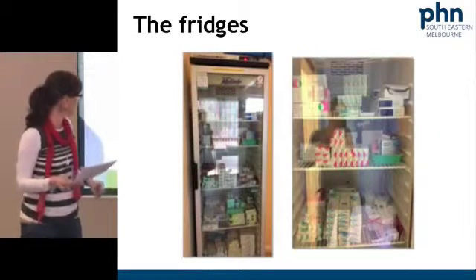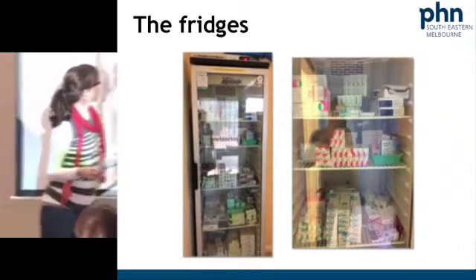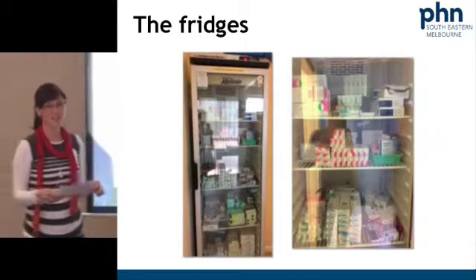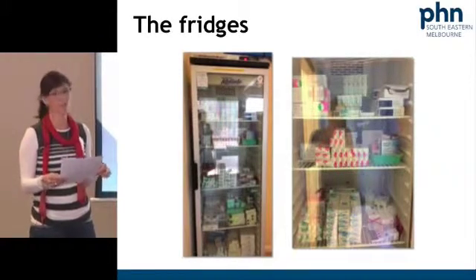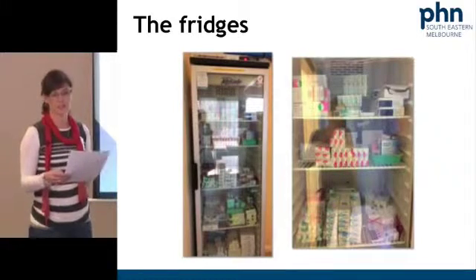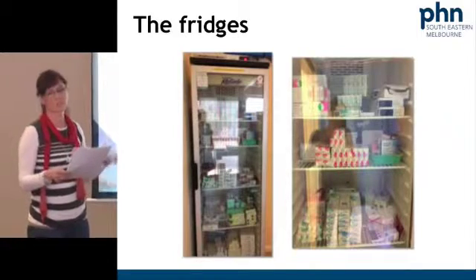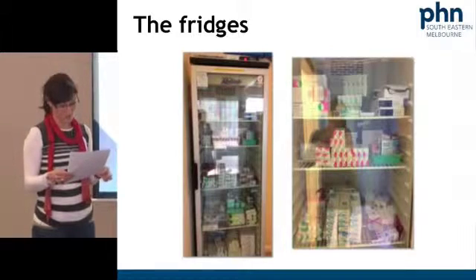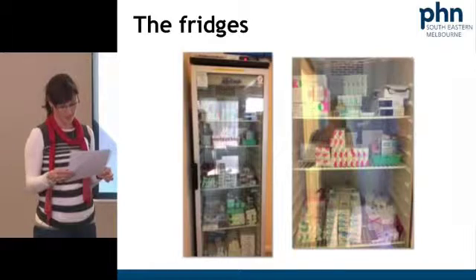or the lower, and you might be able to see one there. We've got one here, one there, and we've got one up here, and there's one that we've placed down the bottom. So we did that late March, and we record the morning and the evening fridge temperatures, and so we're recording these internal fridge temperatures as well, morning and evening. We also carried out a slurry test before putting these thermometers in the fridges, and that passed.